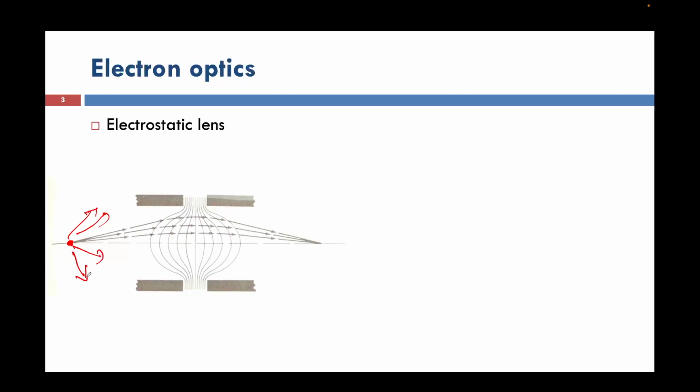How to constrain those electrons from diverging in three-dimensional directions, we will see in the microscopy, how one cap called the Wehnelt cap has been given, right? It will go in all directions since the electron is negatively charged, right? So if we put all these things here, this is also another negative charge. If we put it, then what will happen?